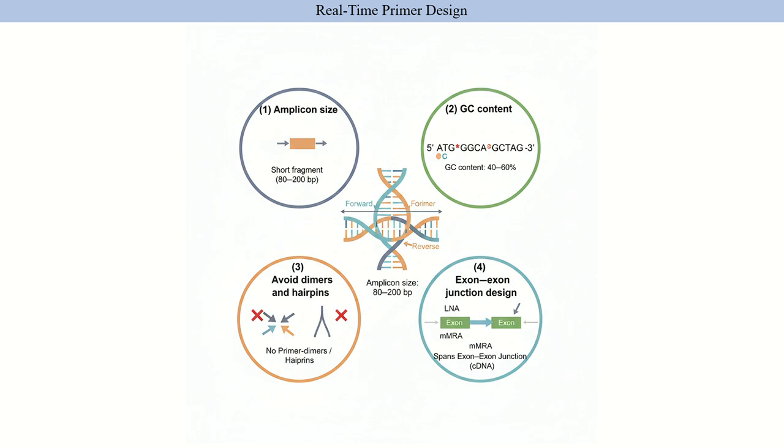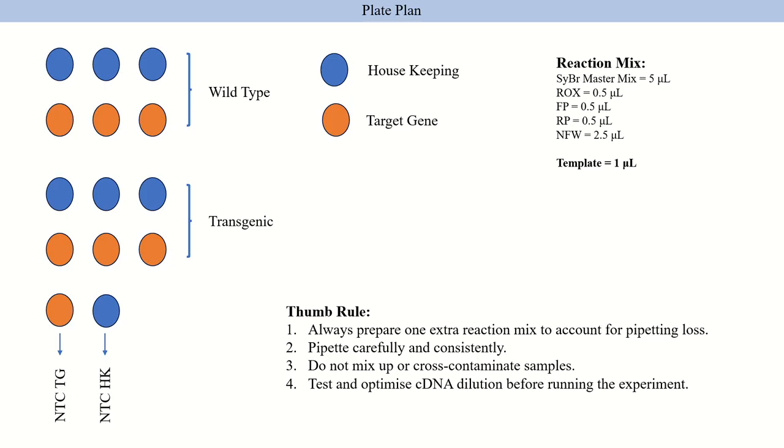With validated primers, we then organize how samples are placed in the reaction plate. Now, a clear plate plan includes sample group, control, housekeeping gene, and replicates. Labeling and layout reduce error and simplify downstream analysis. Include NTC and non-RT controls where needed.